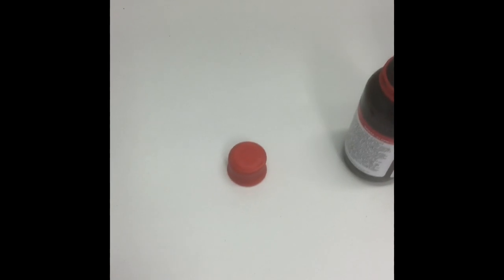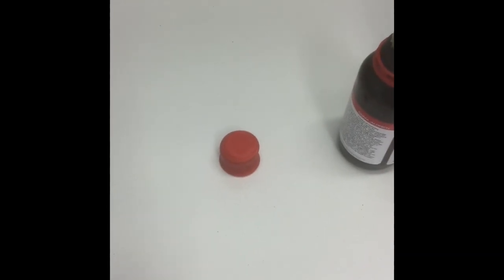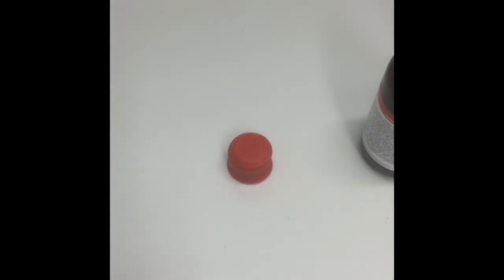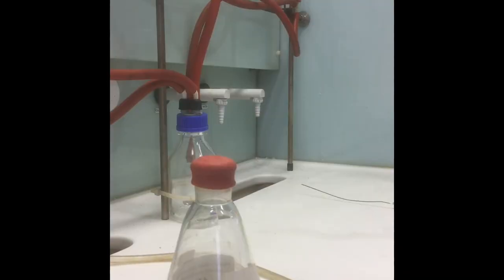More often you will encounter super seals on lab-prepared dry solvents or on your reaction flasks. The area to insert your needle is marked by a circle on the top of the super seal, as shown here.